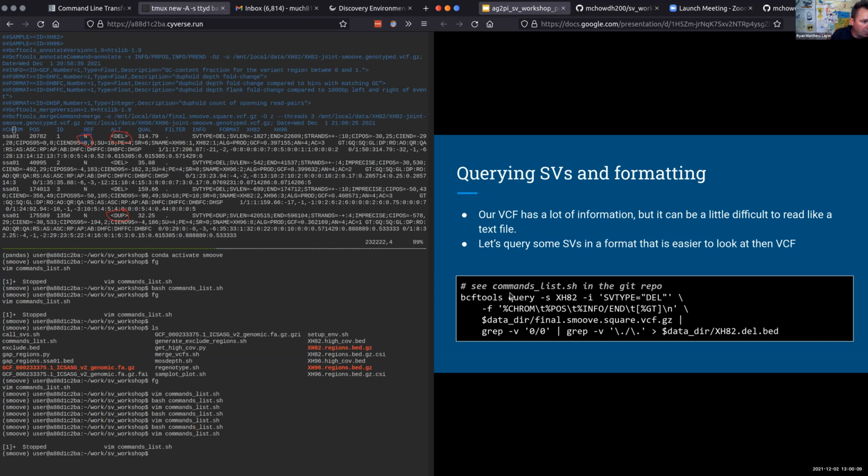Other tools might choose to actually give an allele here and give the base pairs deleted here, which, as you might imagine, for let's say a megabase deletion, you might end up with 1,000 characters, or 1,000,000 characters in this field. So we've chosen a more compact representation. So the fact that there's N there is not to be worried about. And then this just tells you the type. That type is repeated out here in SV type.